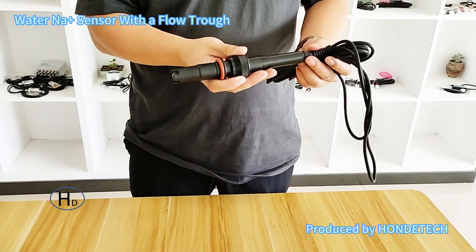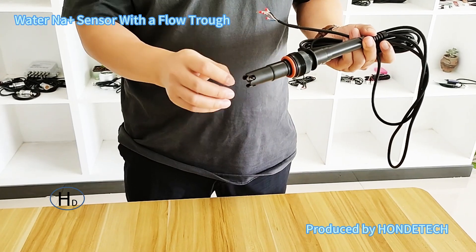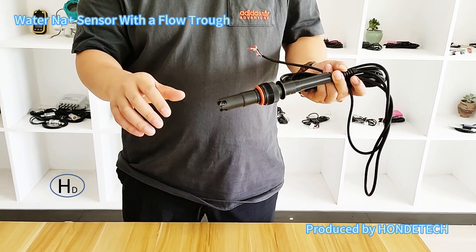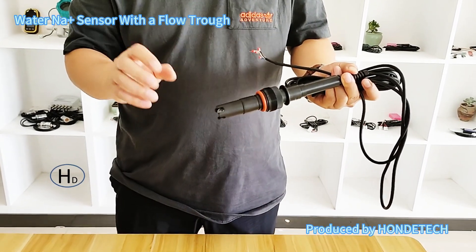The measurement range can be custom made according to your requirement. It can measure the water sodium ion in both clean water and sea water, according to your requirement.